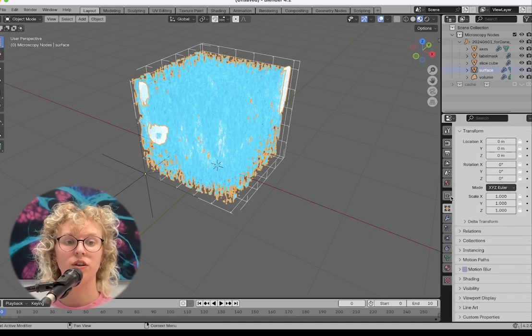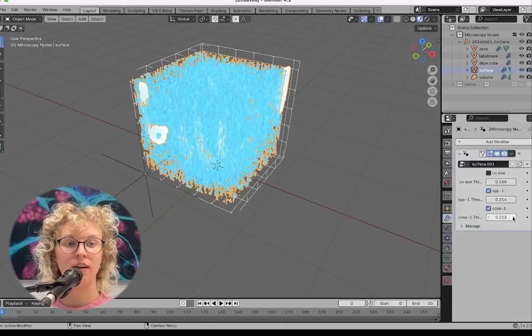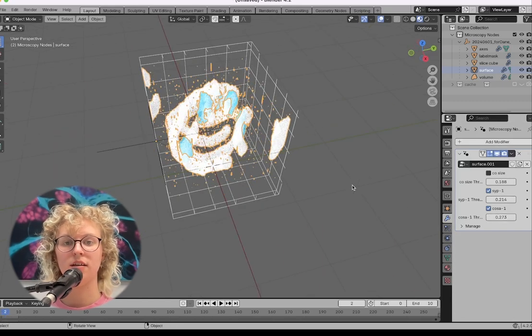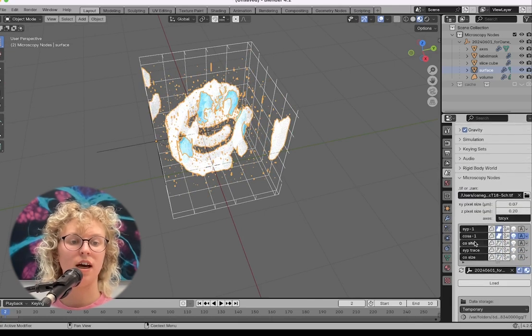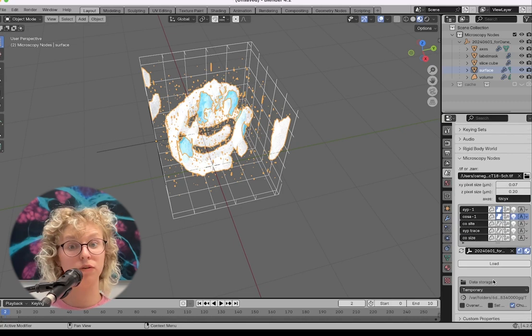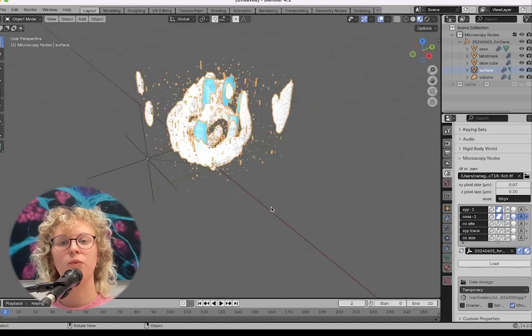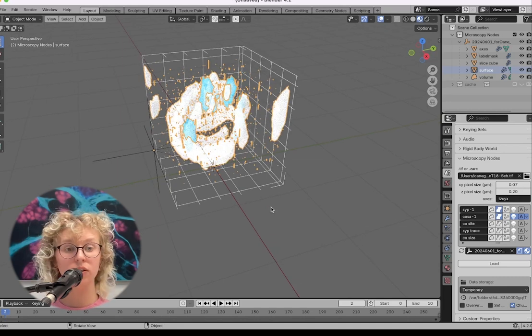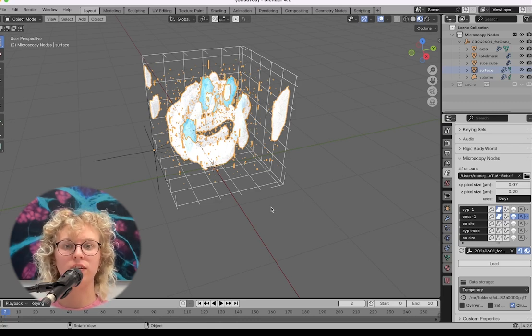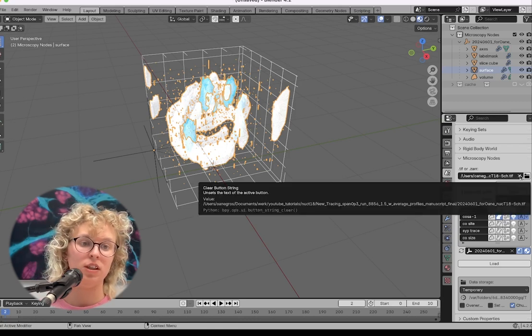So then you can see that we reloaded the data with different settings. And now in the surfaces, we would need to set the threshold slightly differently. But you can see that there's the data through time as it was. So this is how this reloading works. This can also make sense if you have, for example, temporary files that got deleted, you can still reload them like this. Here we have essentially everything that we can do with TIFF files, and this is, I think, already quite powerful. But with OME-Zarr, this format gives a few extra features, which I'll show right now as well.